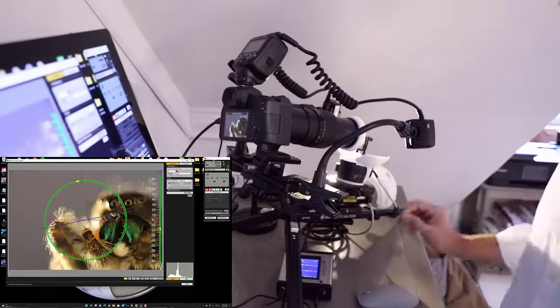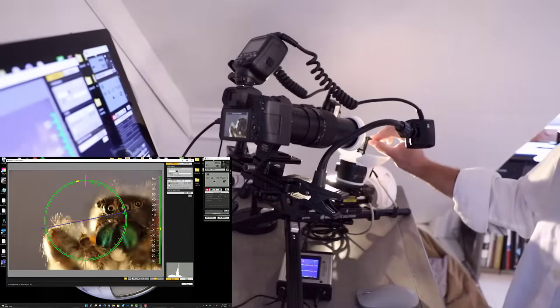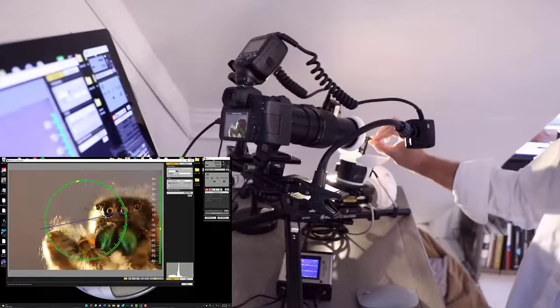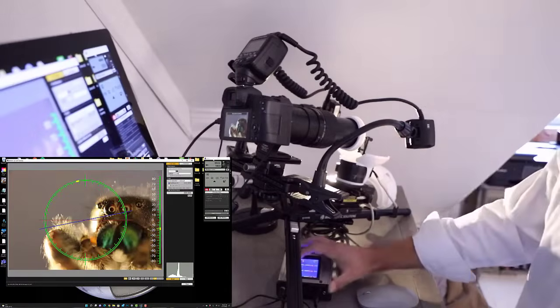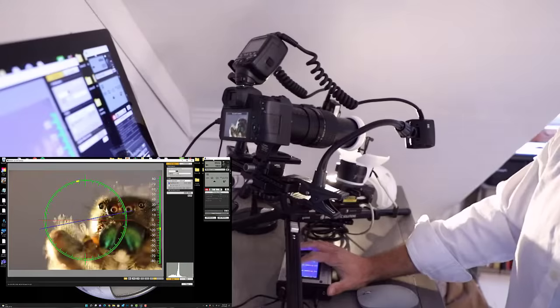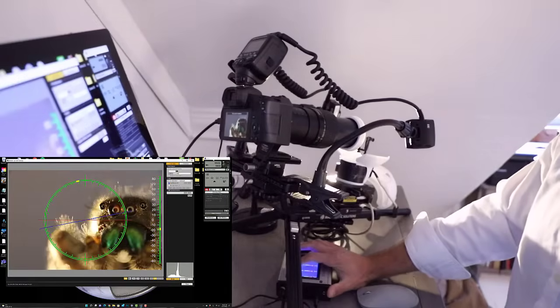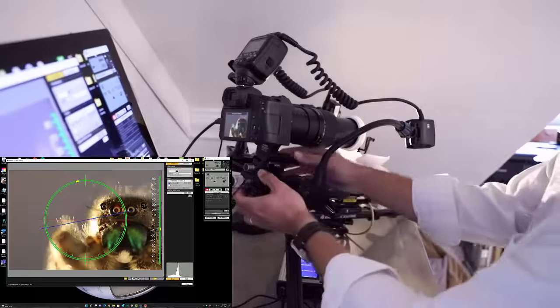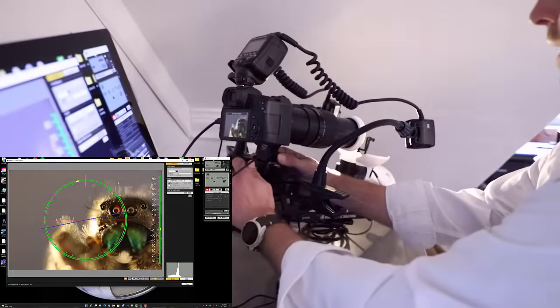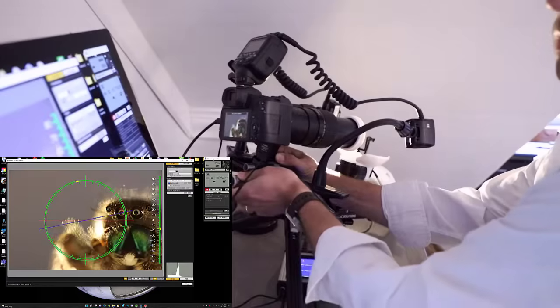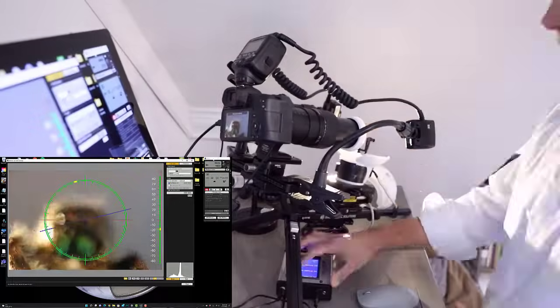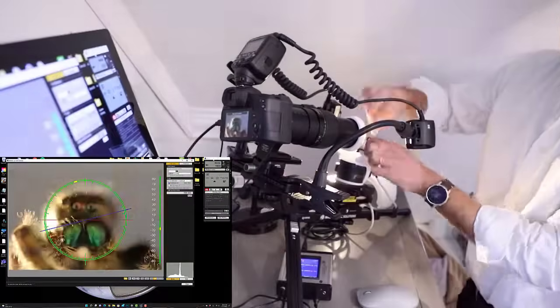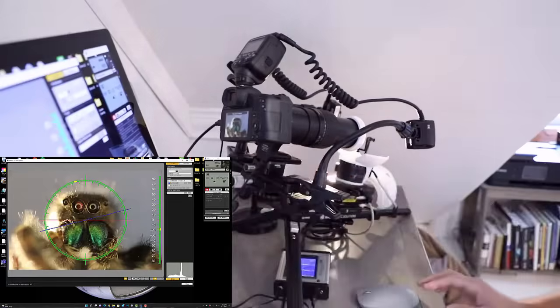While that's opening, I'll just go ahead and get started positioning this in a way that should work for us. We'll get a little bit more light on this. We're just going to use a light just for orienting the specimen. You can see here we have everything mounted on the universal stage. We have great flexibility up and down, basically all five axes that we need. A and B axes and your X, Y, and Z.